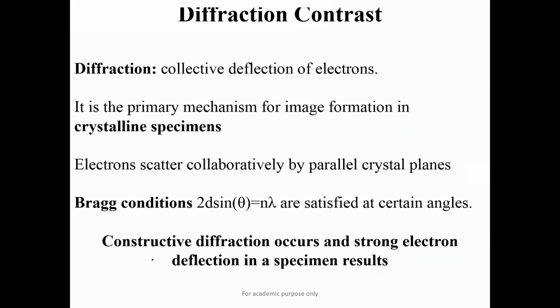Now let's come to diffraction contrast. Diffraction, as we know, is a collective deflection of electrons, and this is the primary mechanism for image formation in crystalline solids. So suppose here we have a number of planes.